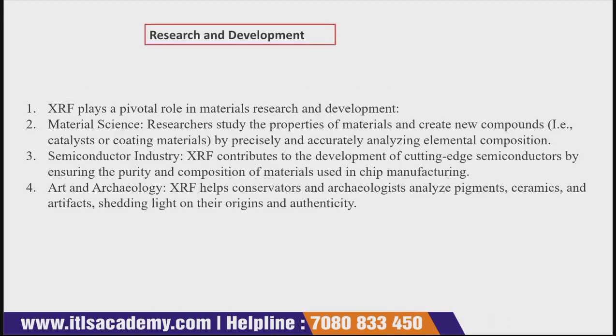Now let us talk about how X-ray fluorescence spectroscopy has applications in research and development. It plays a very pivotal role in material research and development.